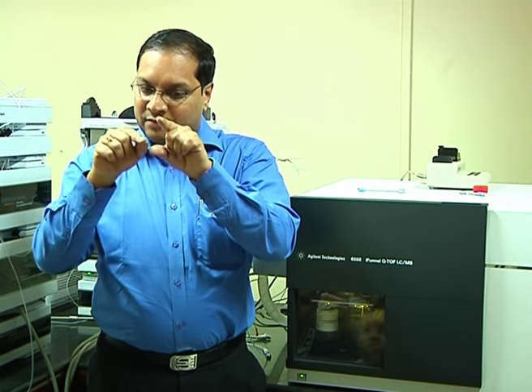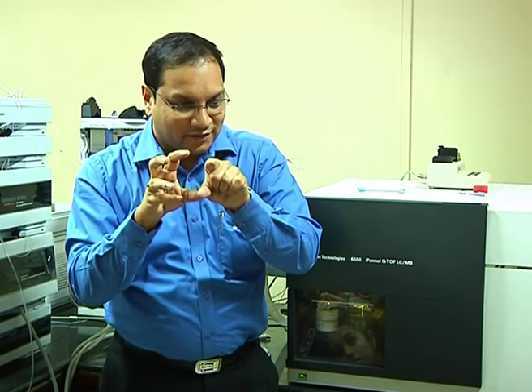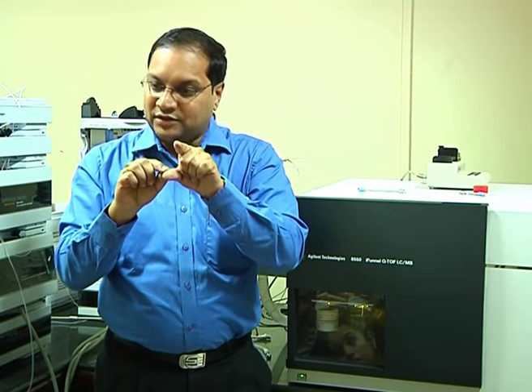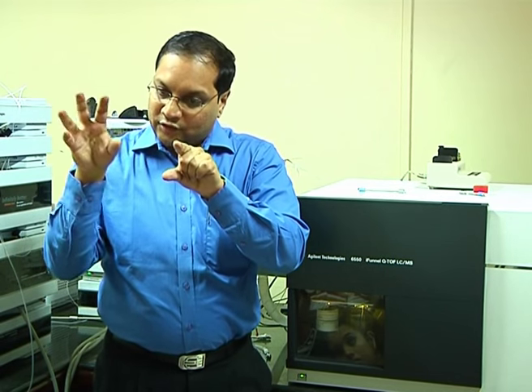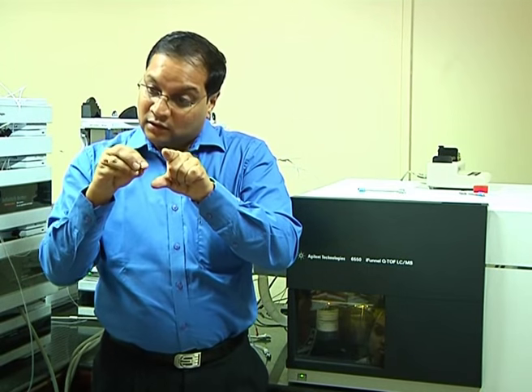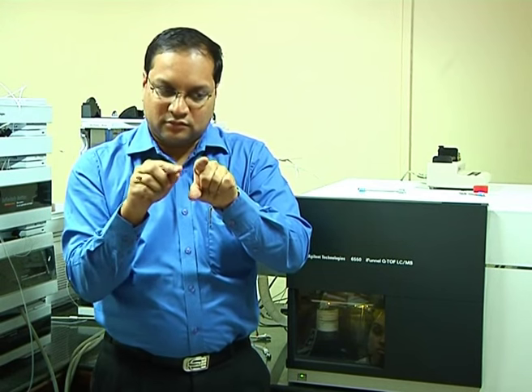The ion will come here. The 500 ion will come here along with 10,000 other ions. Okay, but it has applied the right energy to capture only 500. So what will happen? Out of 10,000, maybe 9,000 get lost. They will hit somewhere and get lost. Along with 500, maybe 9,000 more ions will get in somehow because of the voltage.